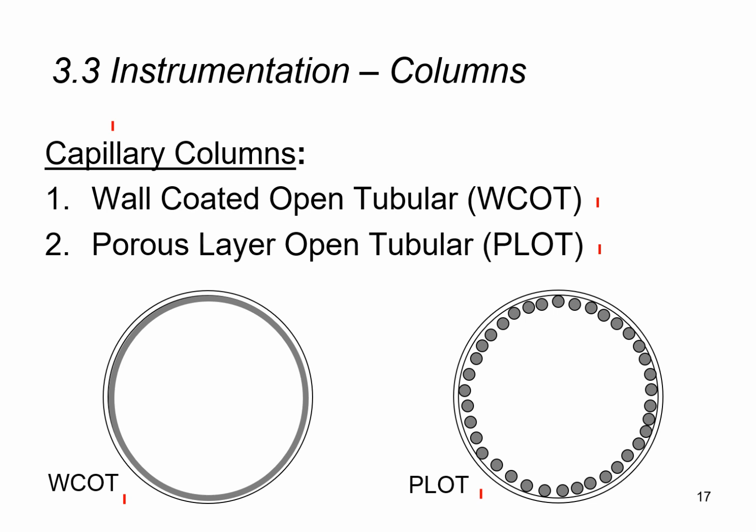Between these two types of capillary columns, the effectiveness is the same. This is purely a design difference. Some column manufacturers manufacture their columns using the wall-coated method, and some manufacturers design their columns using the porous layer method. Both are equally good at generating separation, and therefore there isn't much difference between the two of them besides the design.